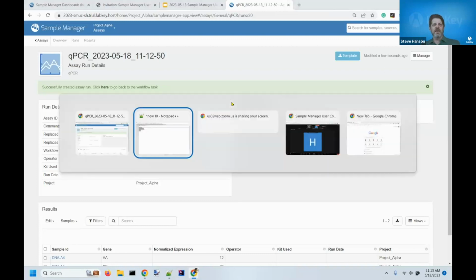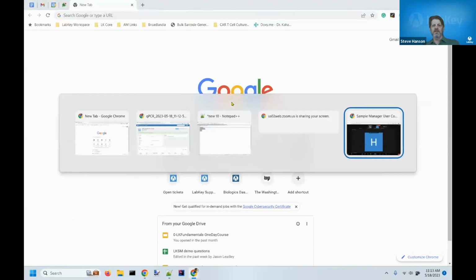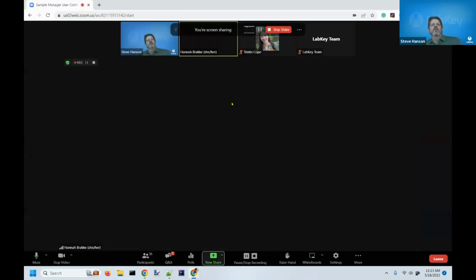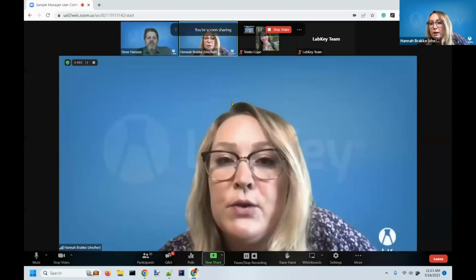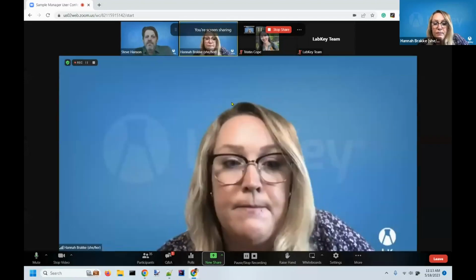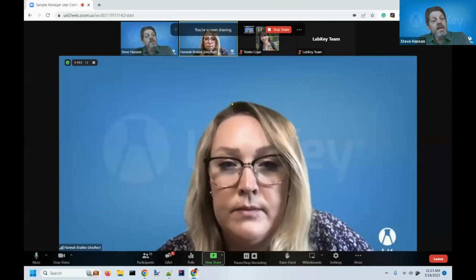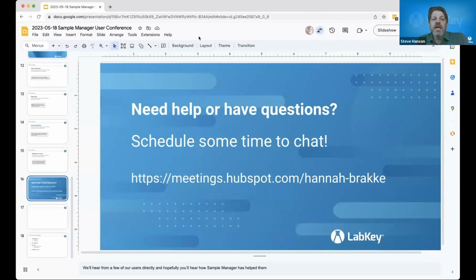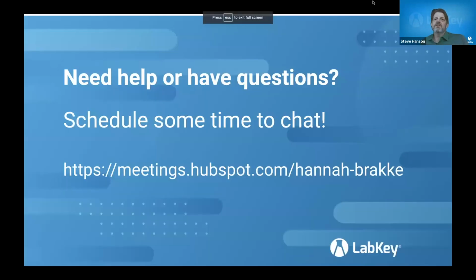Questions or anything, Hannah, that are out there? Yes. Is storage shared across projects? It is. It has much the same behavior as tables. The actual shape of the freezers is shared, but that doesn't mean that you can just see all the data or all of the vials that are in the freezer.